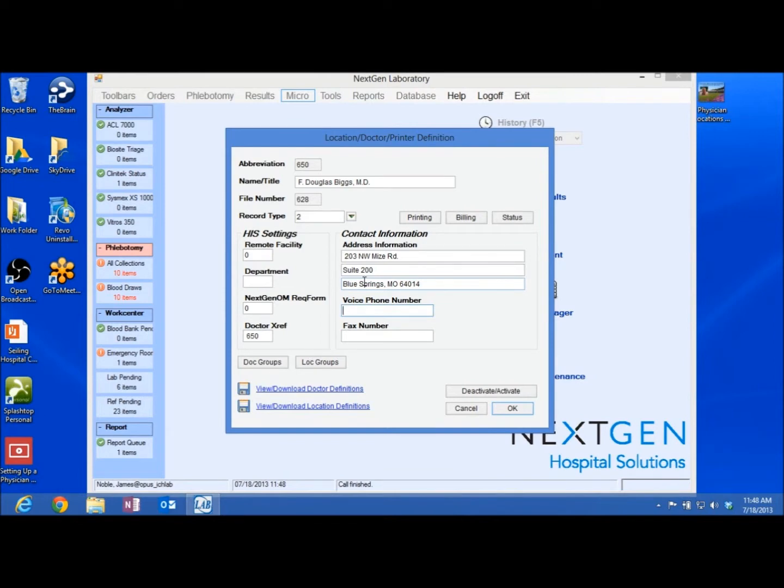Well, I tell you what, there's two ways of doing this. It really doesn't need spaces or dashes or anything like that. You can put those in if you wish to. If you don't want to worry about doing that, you can just put in the phone number 220-1117, and that will work just fine. Or, if it makes it a little bit more readable for you, you can go ahead and put in your dashes.